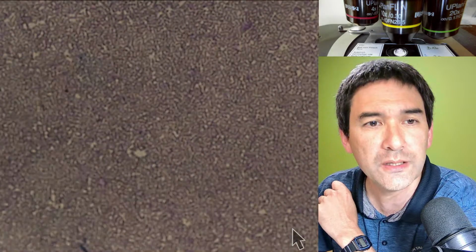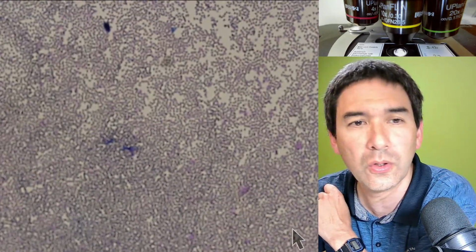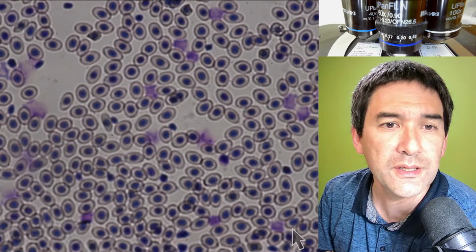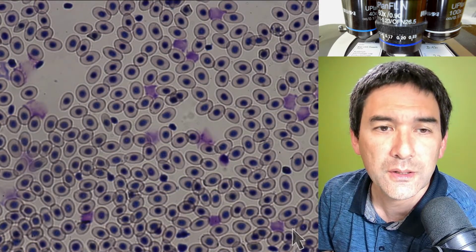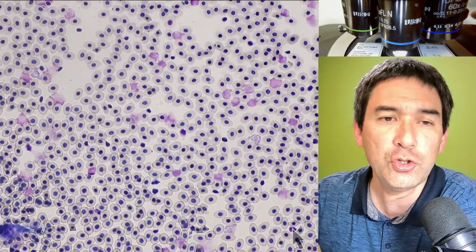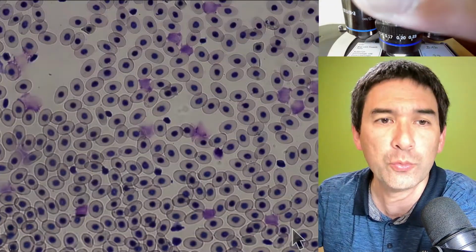It's a little too bright here. Is this the frog? Yes, it's the frog blood with the nuclei. Okay, so let's do the following. Let's go up here. Okay, I need to make it brighter. Here it is, right? So what I've been doing right now is changing the magnification using the objectives.